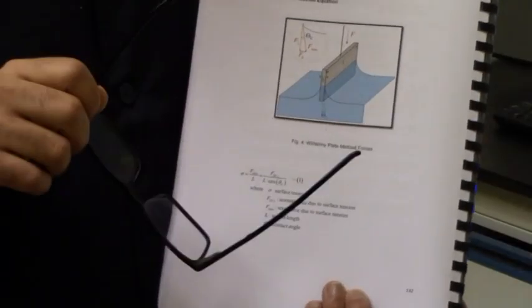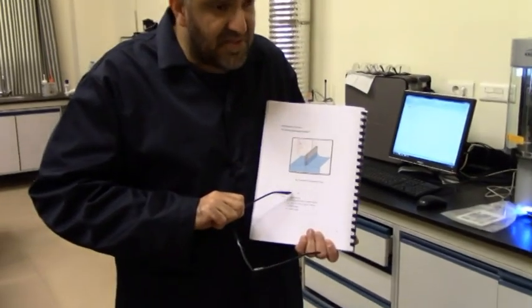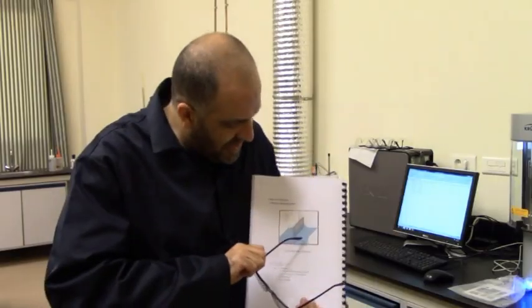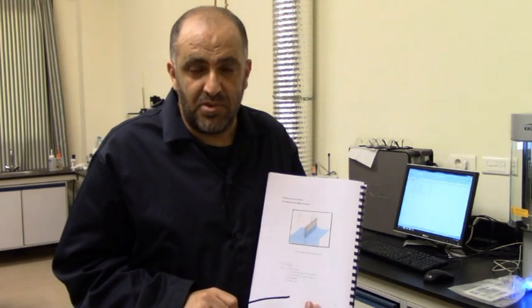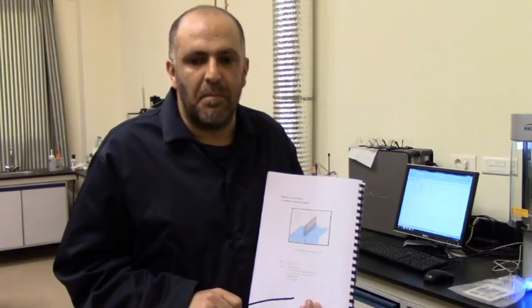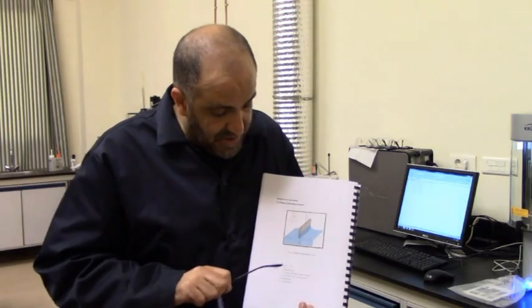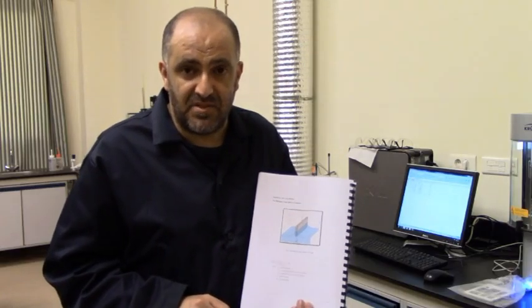Why is this true? This is true because we have used the special plate that is clean and red hot. And this is important to assume that the contact angle is very minute, actually zero. So we have a perfect wetting. That's why we have this pulling up of water by the plate. So the plate has the water pulled to it, so the plate is perfectly wet by water. Accordingly, this theta c is assumed to be zero, and this is a fair assumption.